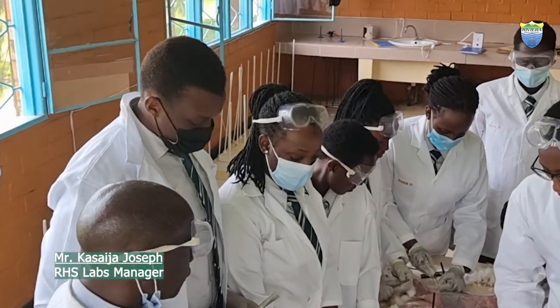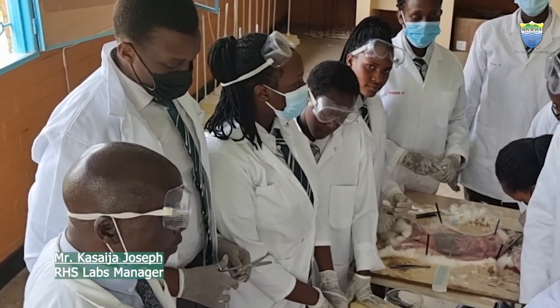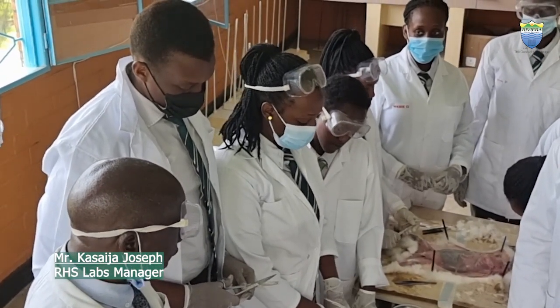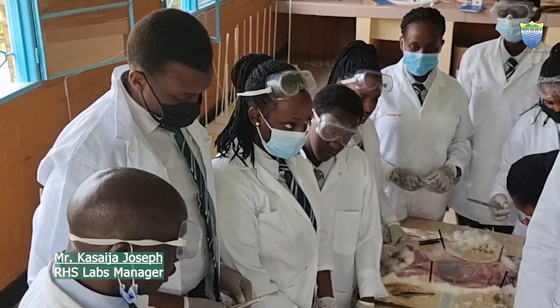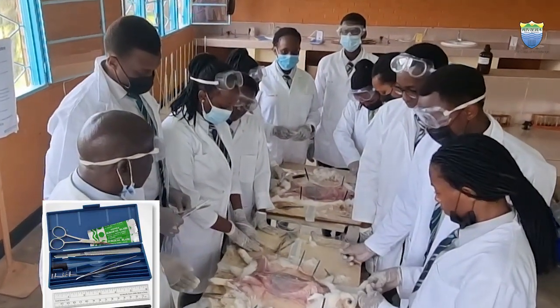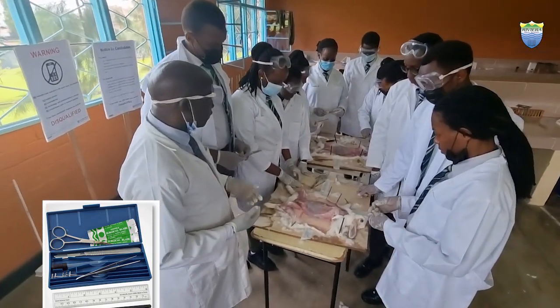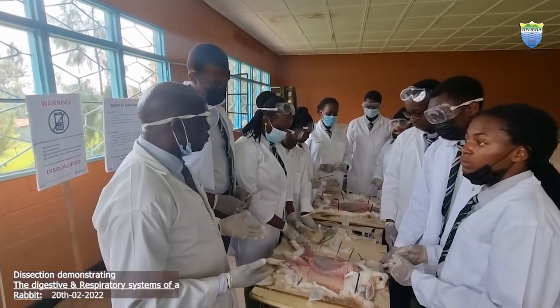I'm going to take you through this practical. We are going to dissect the rabbit, and in dissection the materials required are the following. We need the dissecting board, the dissecting pins, dissecting instruments in general, the pair of scissors. Everyone is given two pairs of scissors. Then we have the forceps and the animal.